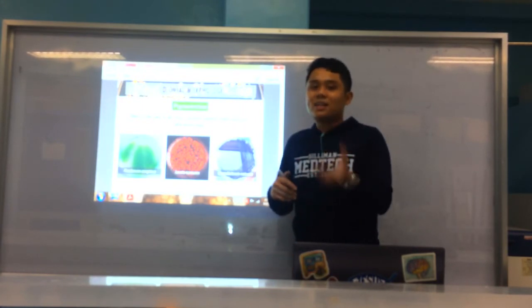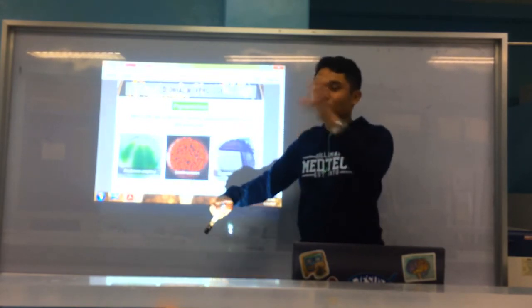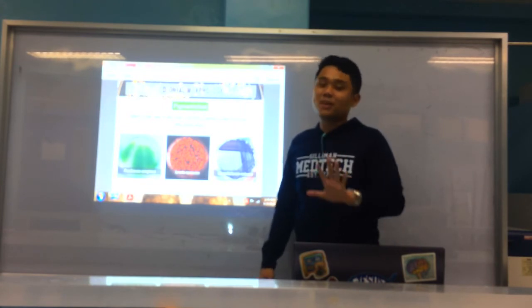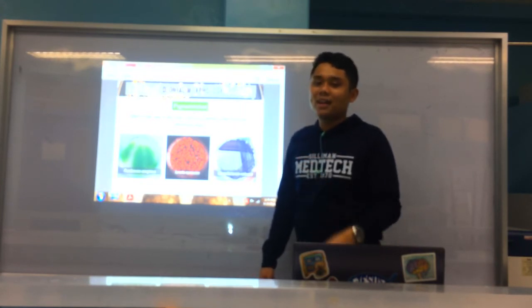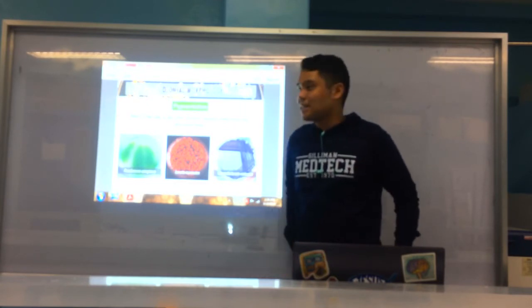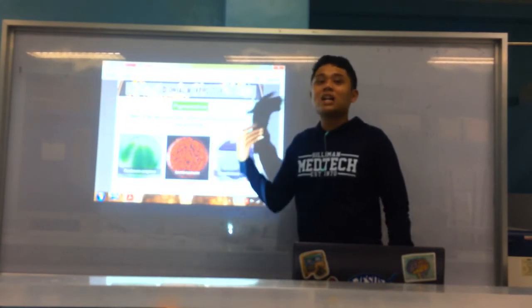And then you will identify it. So basically, if you receive nutrient agar, which is a non-differential medium, and the medium is green, press the buzzer. Once I receive it, I already think, this could be Pseudomonas, because Pseudomonas aeruginosa is well known to produce a lot of pigments.